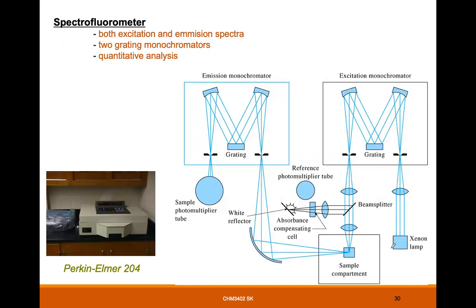This is the light source, used to have fluorescence. The light source usually ranges from ultraviolet to visible. And you have a monochromator. Just now, remember that we need to come up with a proper excitation wavelength, right? So the monochromator gives you the possibility of choosing, narrowing down the lambda for the excitation wavelength.